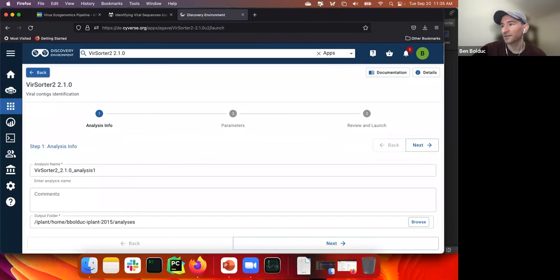Does Trimmomatic have the Illumina sequences already incorporated into it? No, Trimmomatic does not. You will need to select them either from a file that you've uploaded, a primer or adapter file that you've uploaded, or you can use the adapter files that are available through the iVirus folder that I keep on navigating to. Those should have most, if not all, of the adapters that Trimmomatic uses.